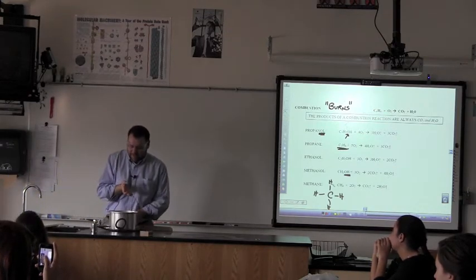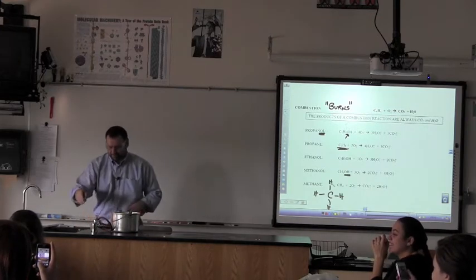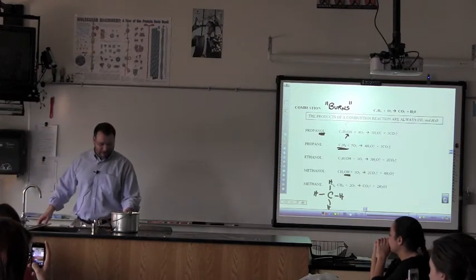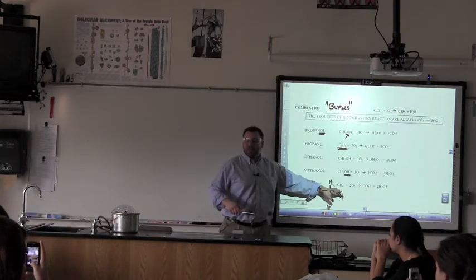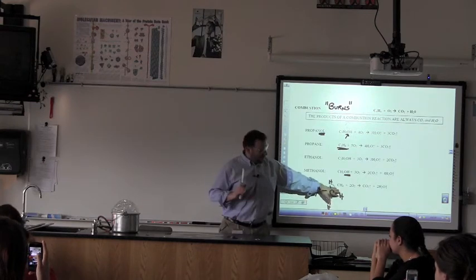Yes, this is why the ceiling is black. There's nothing like a little pot of bubbling methane bubbles. I mean, seriously. Okay, so here we've got the methane. And again, this is the same thing that's coming out of the gas jets. So it's not like you haven't experienced methane before, but you haven't experienced it like this.